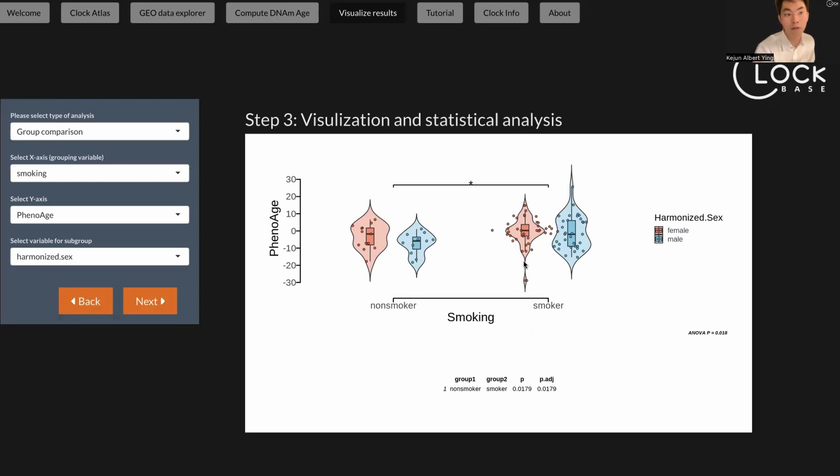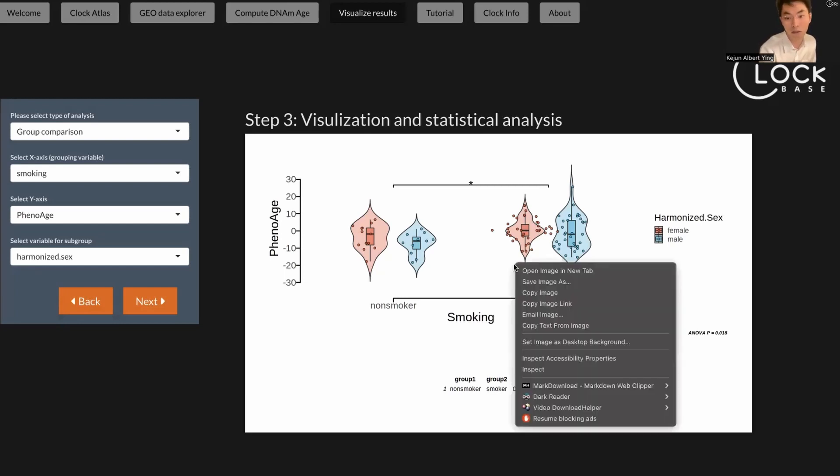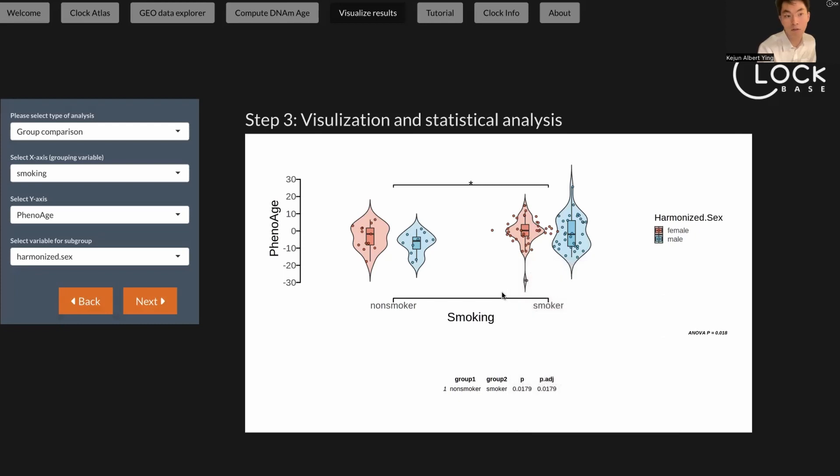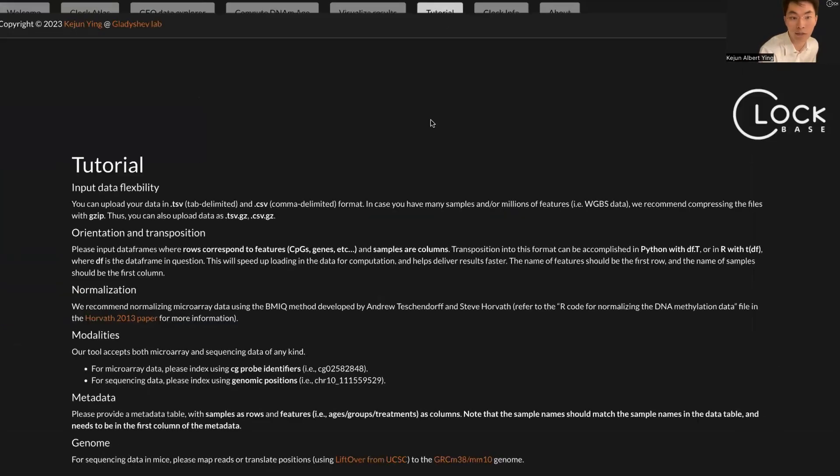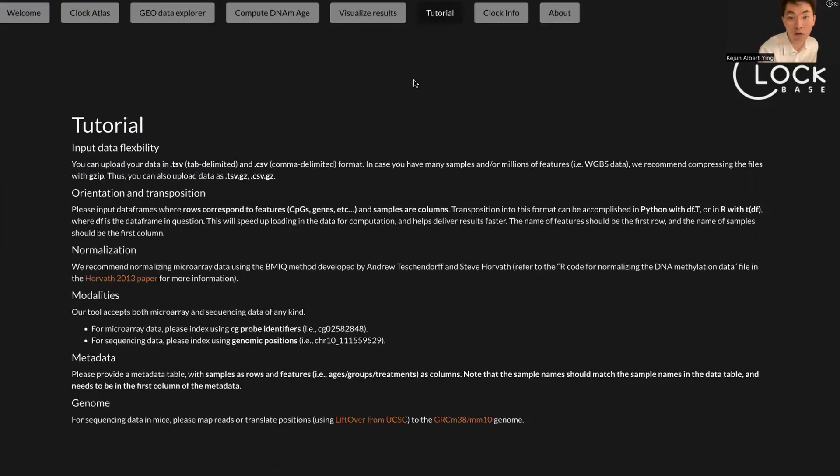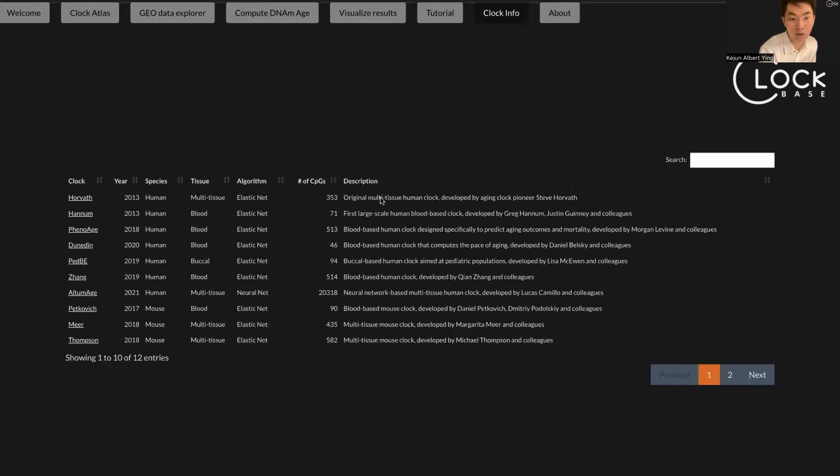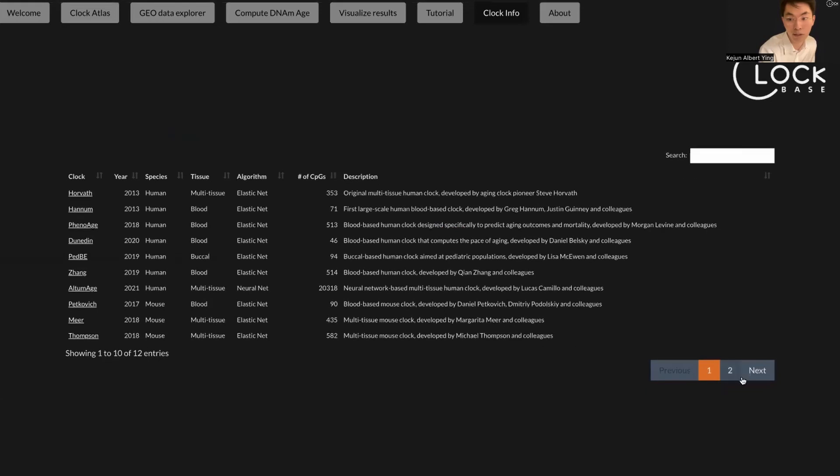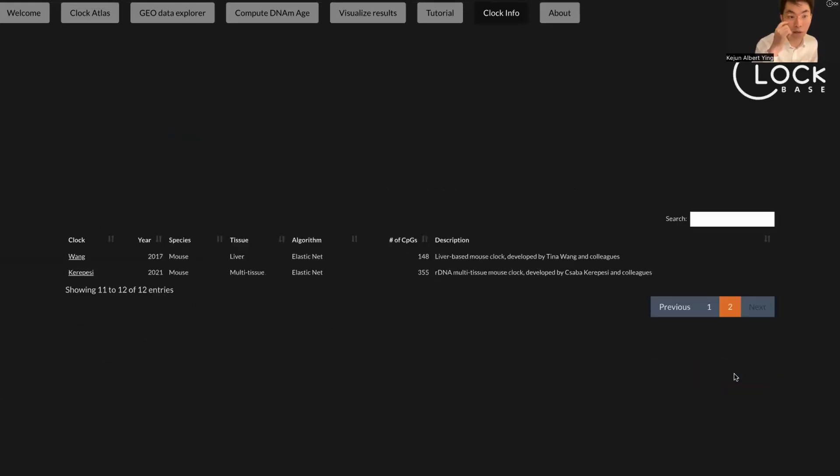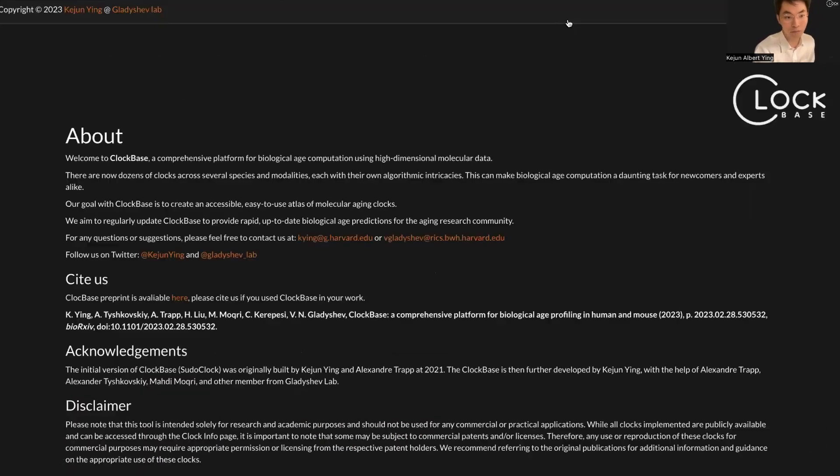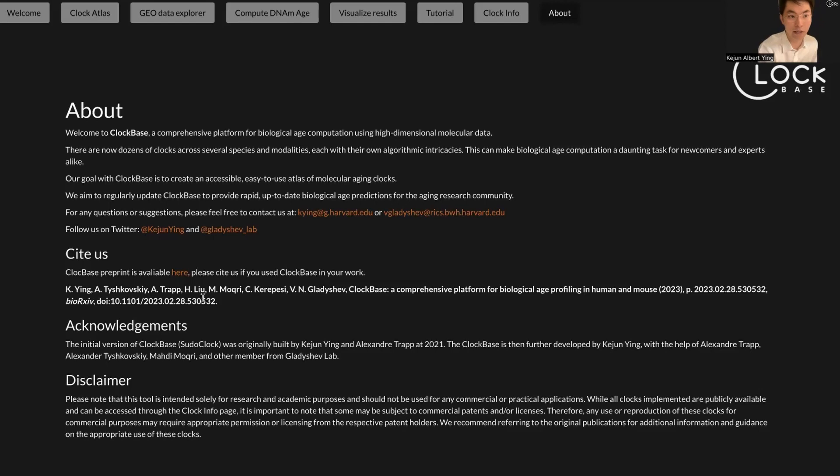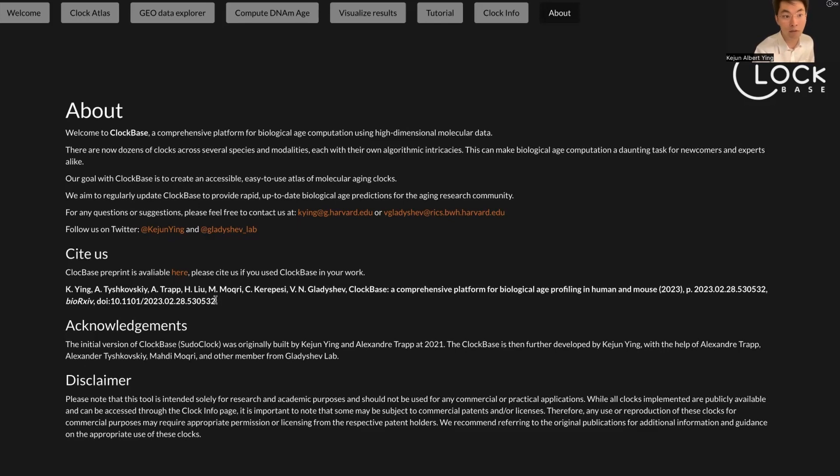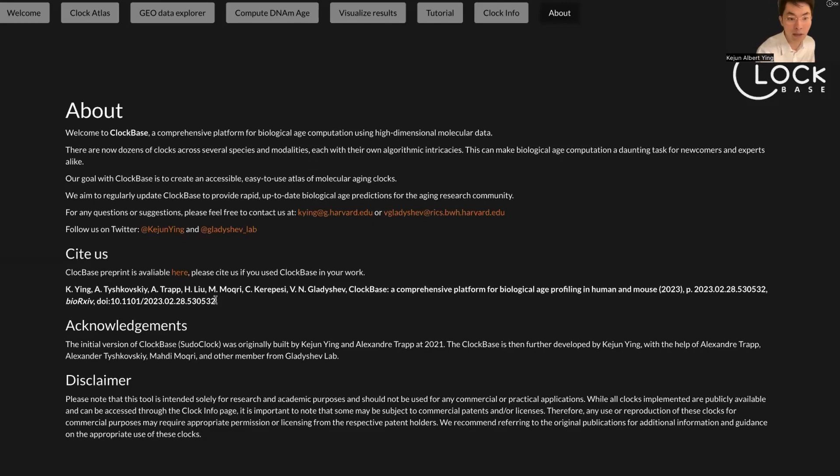Basically it's ready. You can download the image or just make a screenshot and it's ready to be part of your research paper. I think that's pretty much it. You can also look at our tutorial page. We also have a table containing all the clock information we have in our ClockBase. You can also check our preprint here. We already have a preprint paper available online. If you want to know how we did this, how we calculated the aging clocks, how we collected the GEO samples, you can check our preprint.